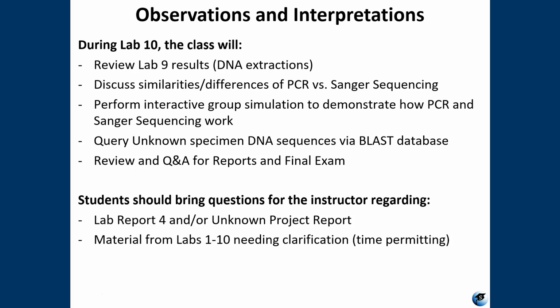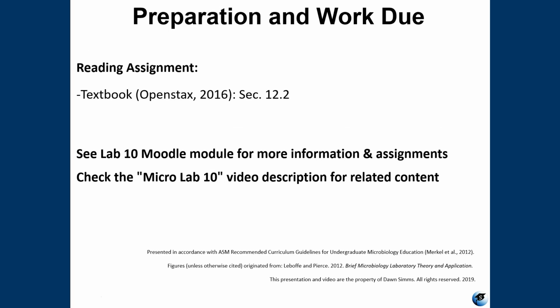We're going to query the unknown sequences together on the BLAST database. And then we're also going to have an in-class review for the final exam. We're going to have Q&A for any issues you're having with your unknown reports. So bring questions for me or for your instructor regarding all of the remaining reports, or any material from any of the labs that you need clarification on. I will answer as many of those questions as possible before we run out of time.